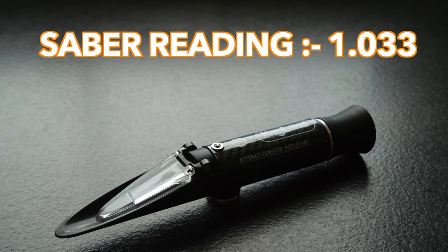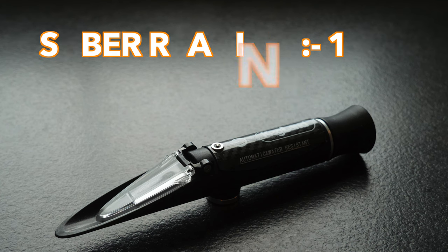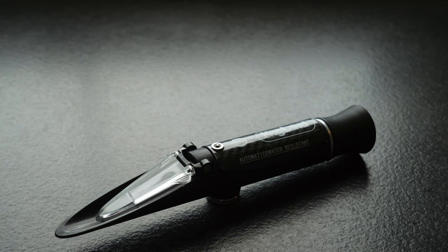Naturally we cannot expect a totally accurate result from this type of device, but this is actually very impressive considering that this is for sure the most accurate result I have seen from such a refractometer. This is also consistent with the accuracy of readings I have seen from the Sabre since I first got it, and this has been with a variety of different wort strengths — though it must be said nothing very high, so the inaccuracy may increase proportionally when measuring worts of higher strength.